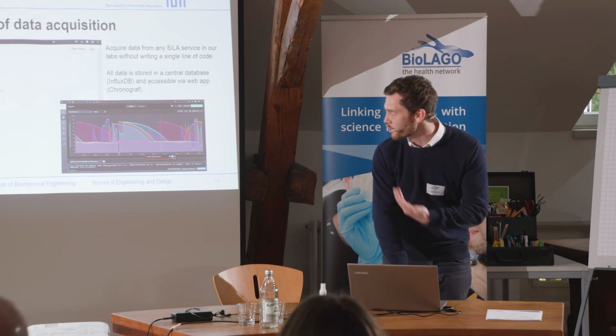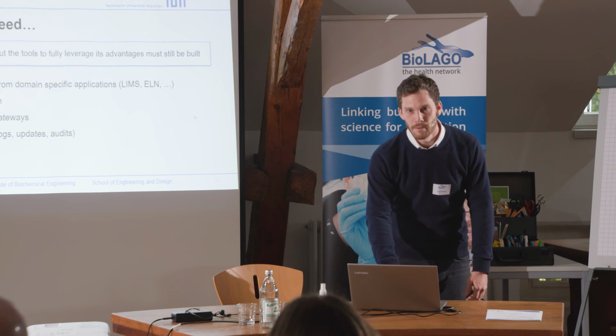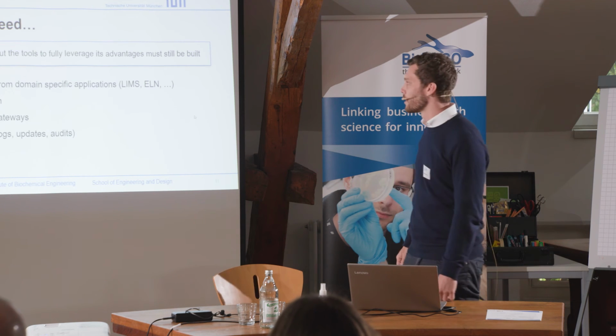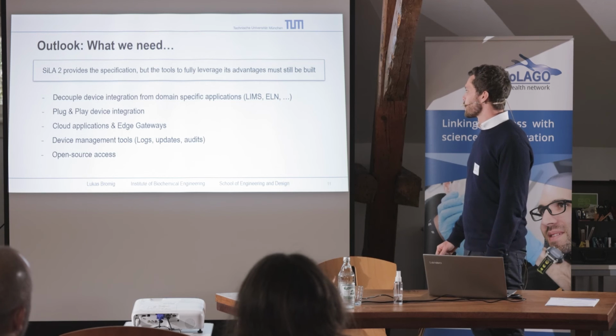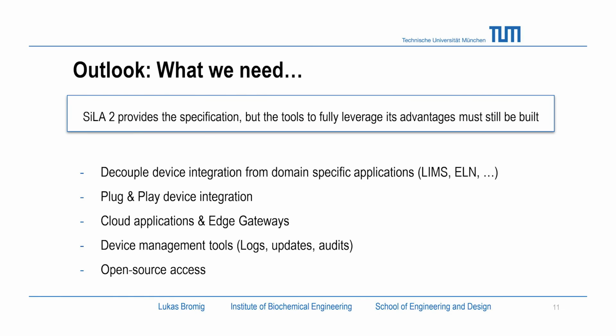And then download it there as a CSV file, or just directly access it with a client in Python or whatever language they are knowledgeable in. So the good thing about SiLA is that it provides the specification, but to fully leverage it, you need all the tools, not just the reference implementations, but ideally also other tools like device management solutions, like the one that I've built.